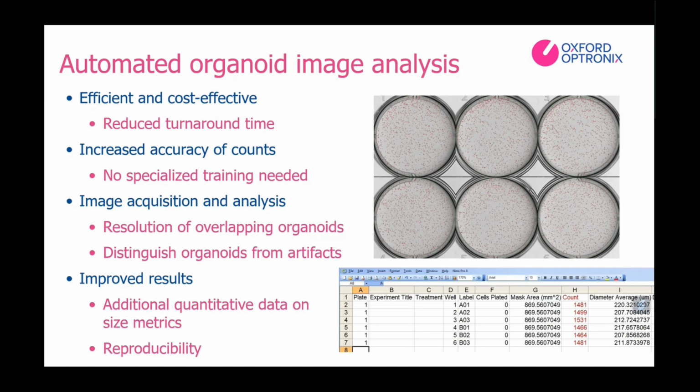Now, what's really nice about automated systems is they do allow for repetitive plate counting of organoids without the need to stain cells. And the lack of needing to stain organoids does mean that longitudinal studies are also a possibility for those who need data at several time points.